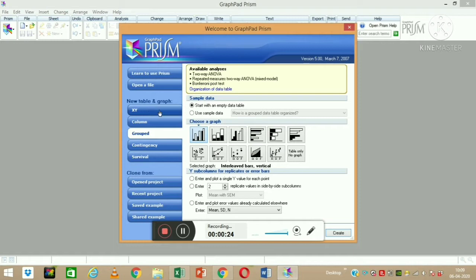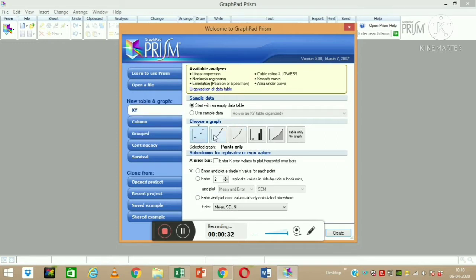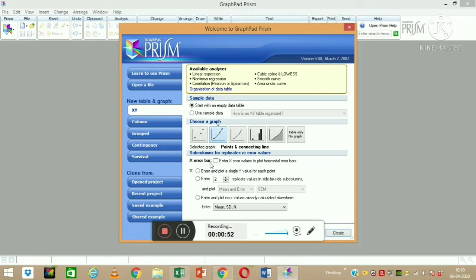We are going to learn XY scatter graph, column graph, and group graph preparation. Starting with XY graph preparation, I'm clicking on this — these are the different types of graphs we can make using X and Y axis values. You can choose any one as per your requirements. I am choosing the second one. You can also make a horizontal graph, but we want to make a vertical graph.